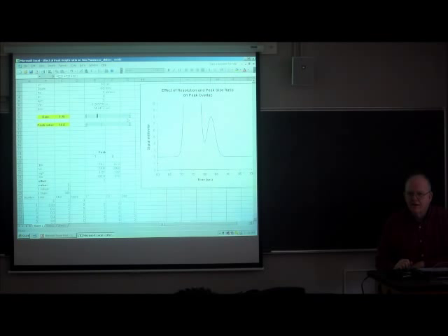With tailing, how do you know the difference between if the analyte is tailing or if it has two peaks coming out? Really good question. How do you tell the difference when you have something with no maxima that just looks ugly on one side? How do you know it's not a tailed peak? And how do you know that it's two peaks together? That's a very difficult question. I'm going to answer it, but I'm not going to answer it right now. There are too many factors involved and stuff you don't know about at this point in time. I'm sorry to dodge, but I have to.